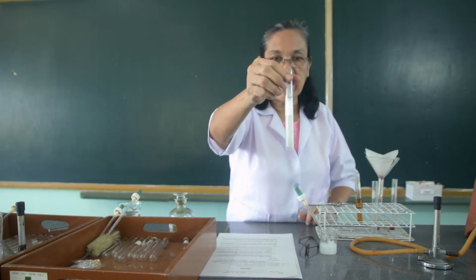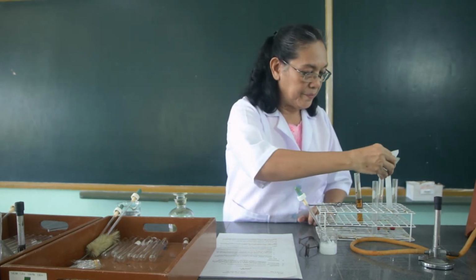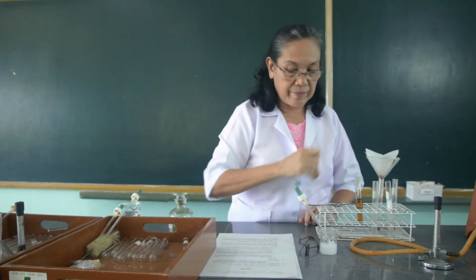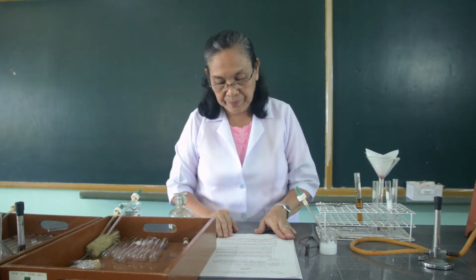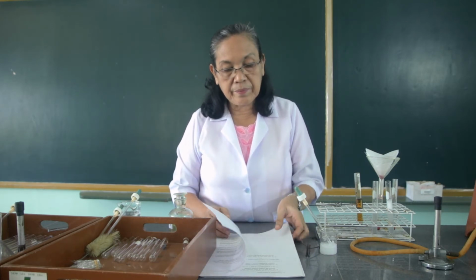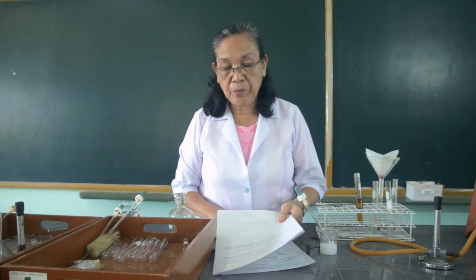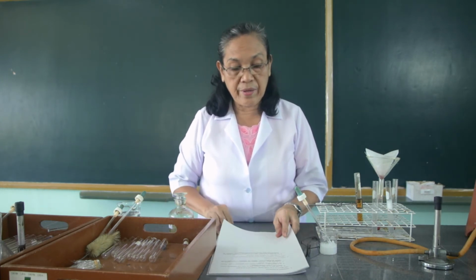Then let's put this aside and we will make the observations later. Let's go to procedure number 5.